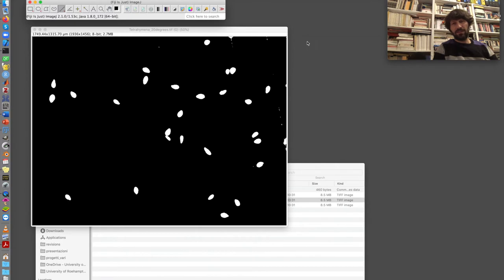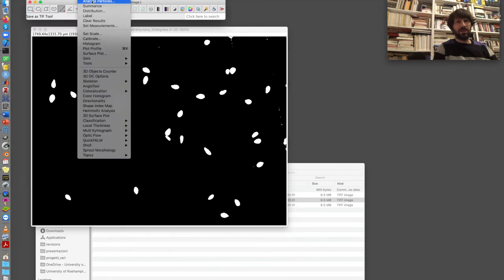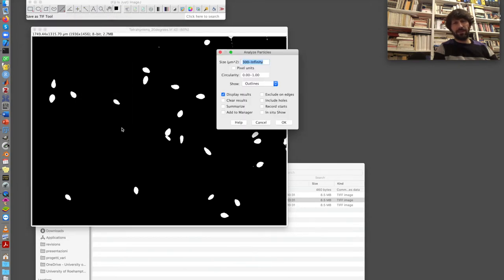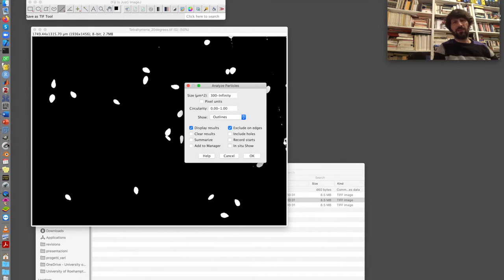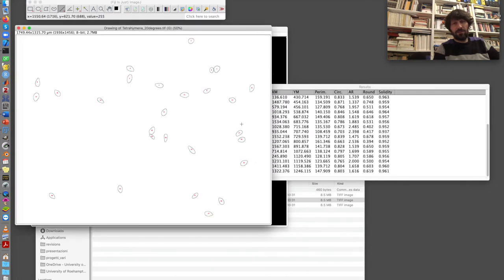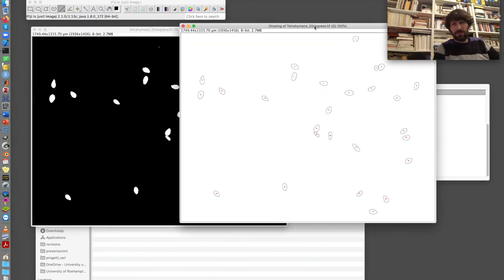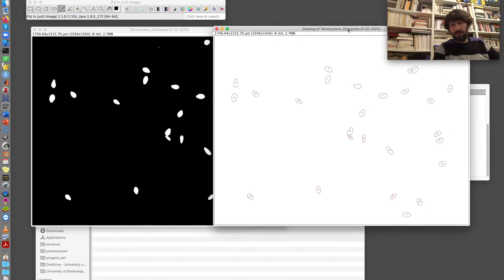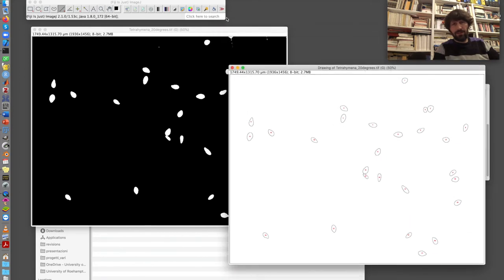I need to label them, and I go again to analyze particles. I use the same parameters as before. The only thing that I wanted to do is that I want to exclude cells that touch the edges, because these are cut, so the measure for area for these cells would not be realistic. And I try and go with the same parameters for now. What do I get now? So I get the cells.